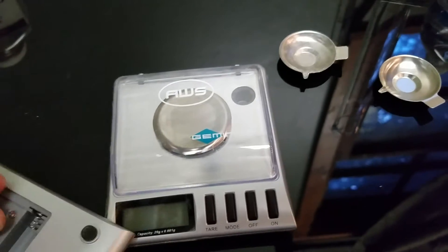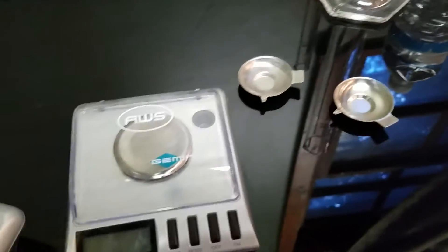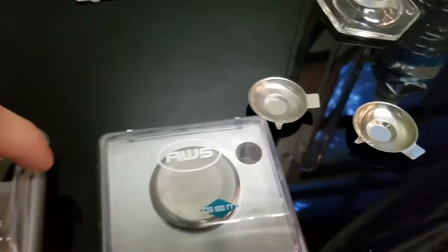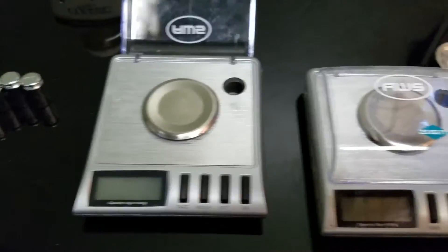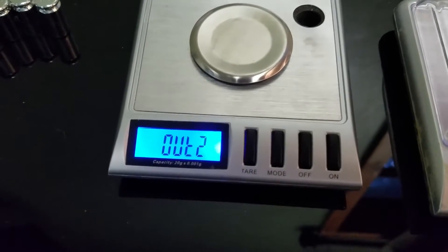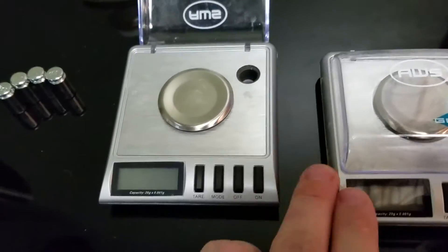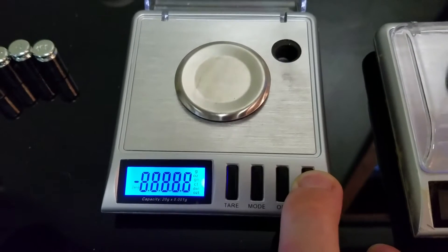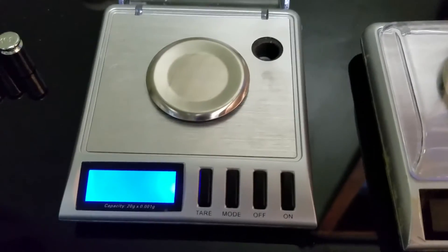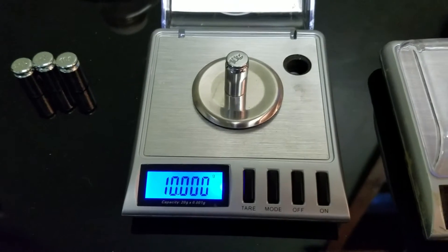Let's call this Scale A and this one Scale B. So, Scale A — let's put the batteries in. Keep in mind it's hot in here because I have the air conditioning and fans off to prevent any change in weight from gusts of air or something similar. Let's turn it on and see if it's functioning properly off the bat. Let's go ahead and take the battery out and calibrate it. I'm going to hold down the on button for a few seconds until it says CAL, press it one more time until the 10 gram starts flashing — that tells me it's time to place a 10 gram weight upon the weighing platform.